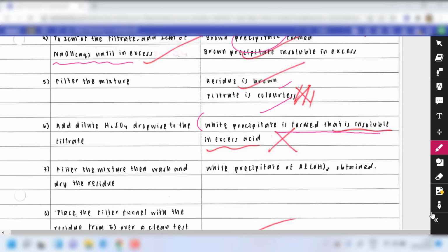It's in a system where it's not very alkaline, not very acidic. So it's trying to find its balance in this very complex equilibrium mixture. So that's definitely not the best way to perform filtration on the precipitate.